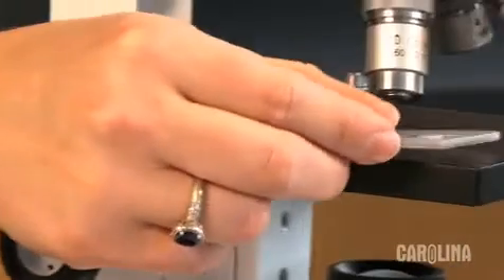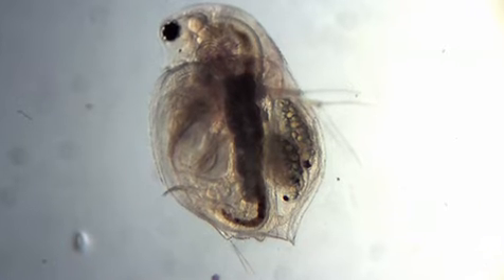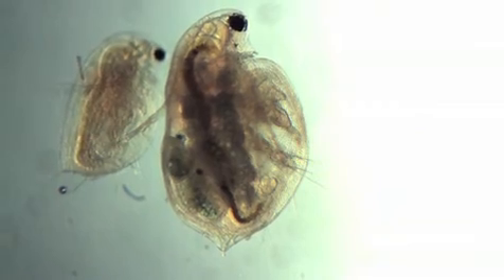Place the slide onto the stage of the microscope. Use the lowest power of your scope and turn on the light. The culture is composed of mostly females. The larger Daphnia are the oldest and may also be pregnant, potentially having new babies during shipment or after receipt.